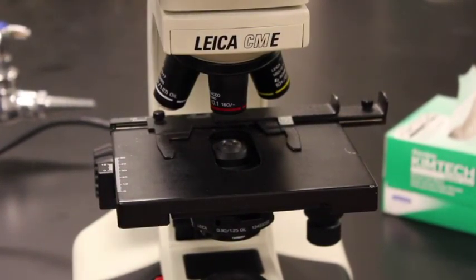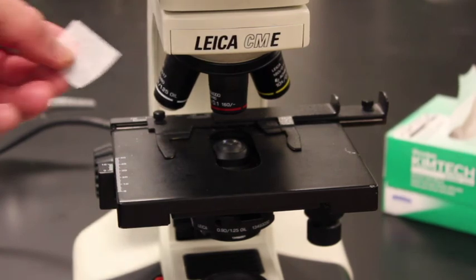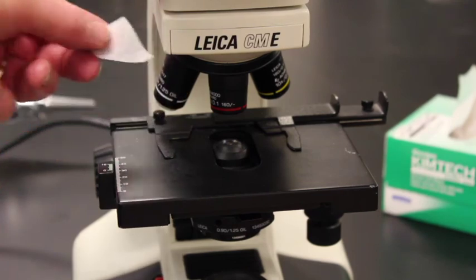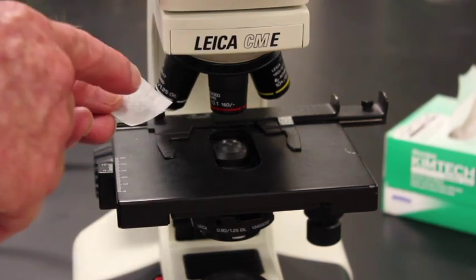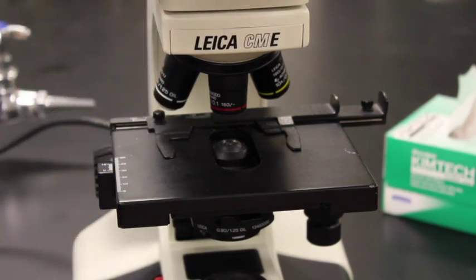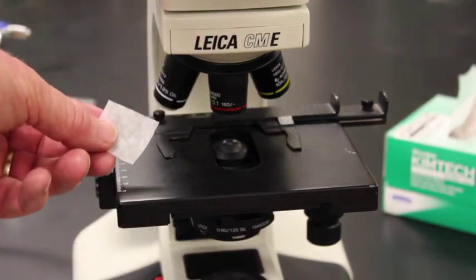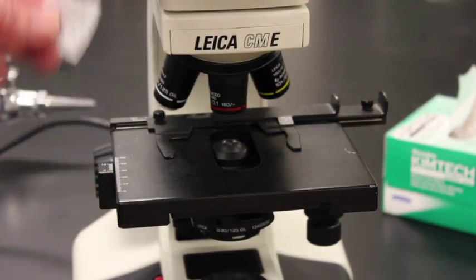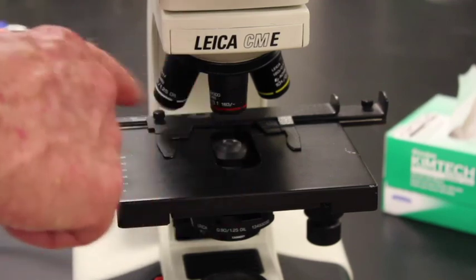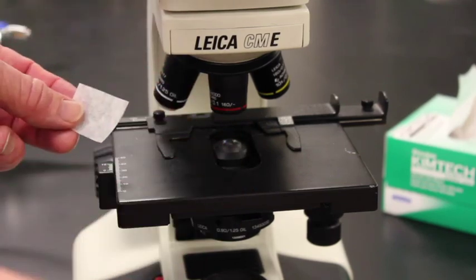And then the last thing that I want to mention is that for a lot of students, one of the things that happens is that they'll take a piece of lens tissue. They will wipe the 100x objective and then get oil all over that lens tissue. And they'll basically take an oily piece of lens tissue, go over here, wipe the 10x, and then in effect wipe oil onto the 10x and oil onto the 40x. Always make sure you have a very clean piece of tissue so that you never wipe oil on an otherwise clean objective.